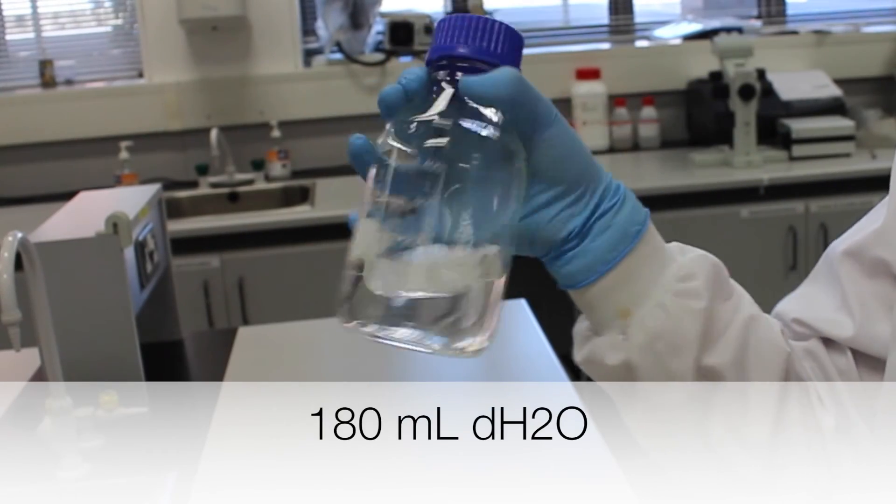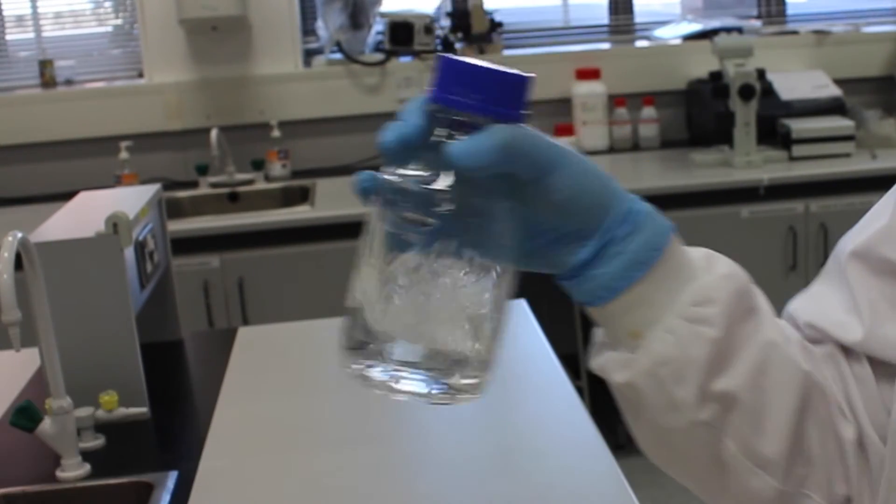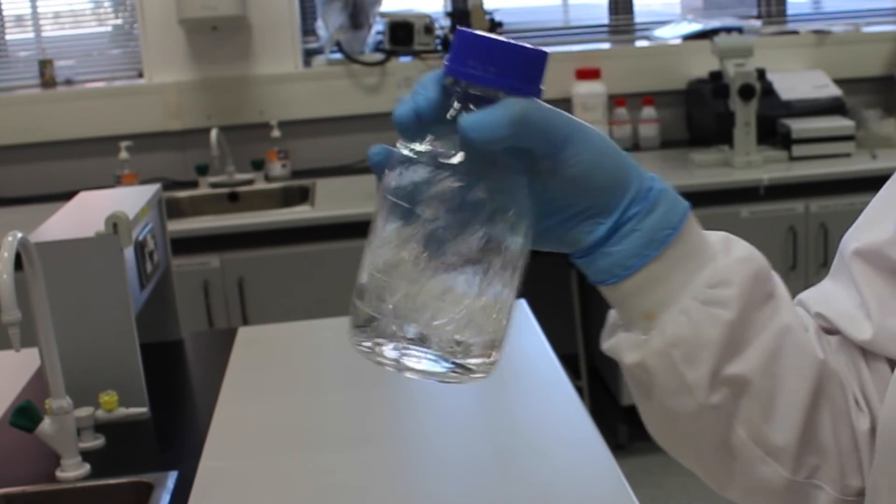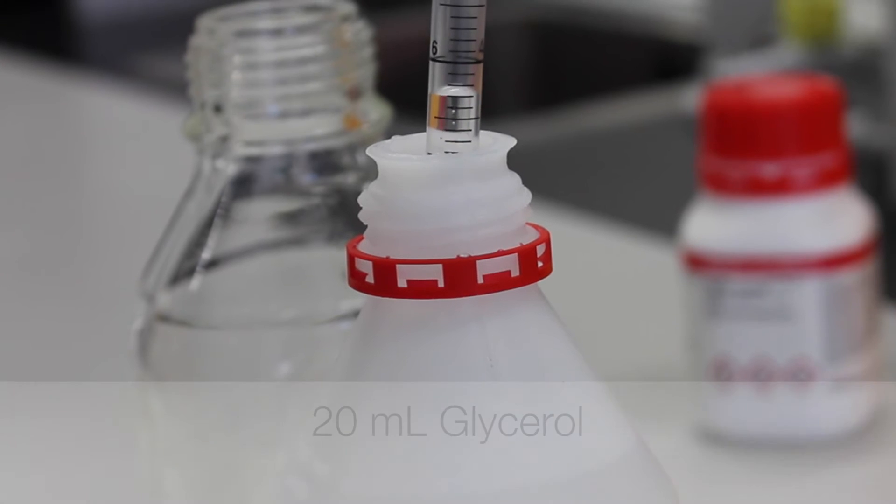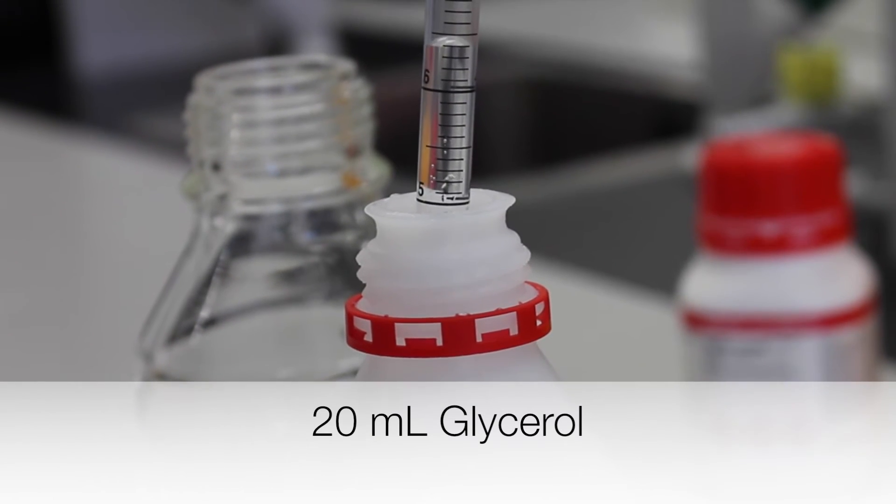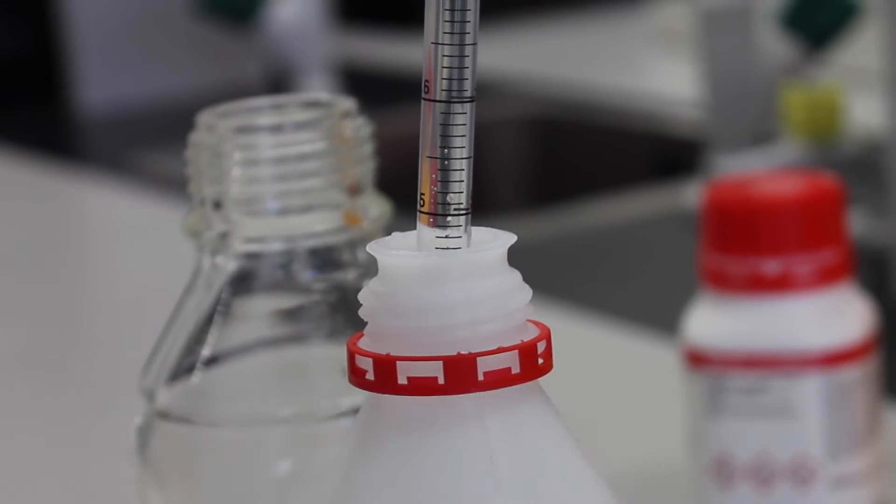180 ml of distilled water is added. The salts are dissolved in the water by swirling the bottle. Once all the salts are dissolved, 20 ml of glycerol is added so that the final volume in the bottle is 200 ml.